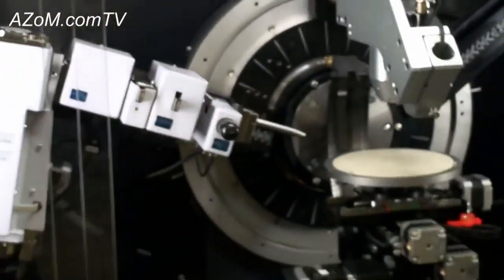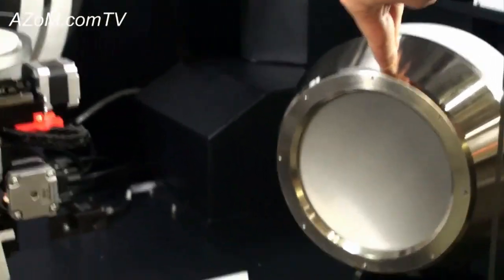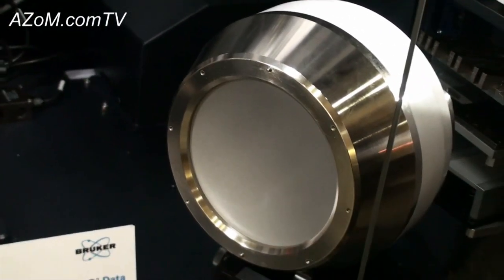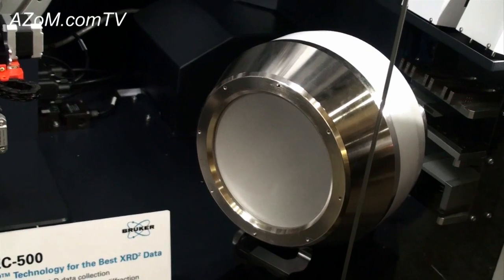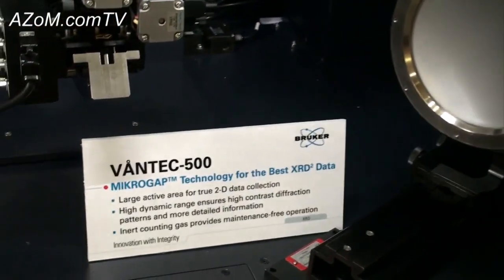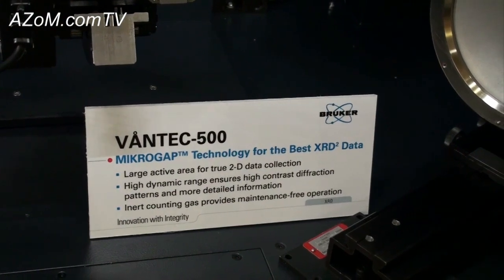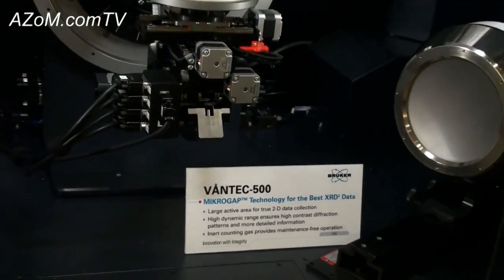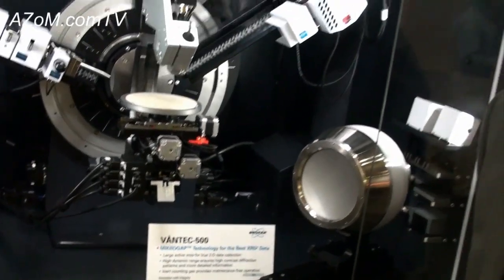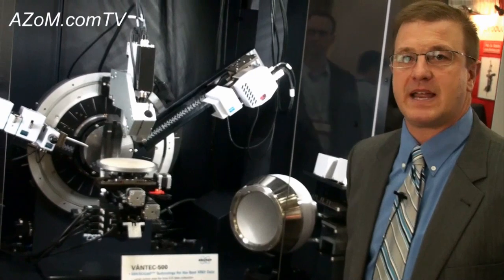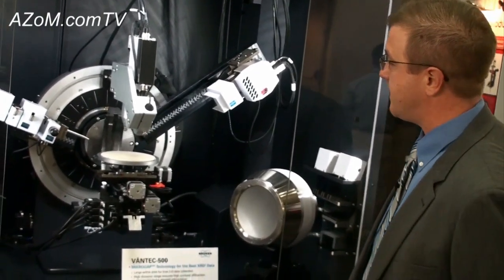One of the really new features of the system is our Vantec 500 two-dimensional detector. This is the largest two-dimensional detector available for the diffraction market. It is patented micro-gap technology, incredible resolution, very high dynamic range. And one of the key features of this particular detector is zero maintenance. So once you purchase the detector, you'll never have to send it back to the factory for any ongoing maintenance issues with the Vantec 500.